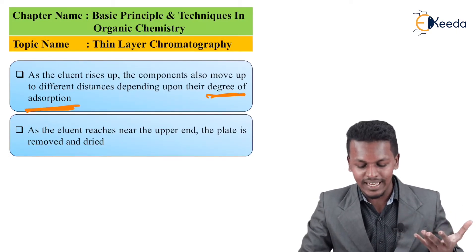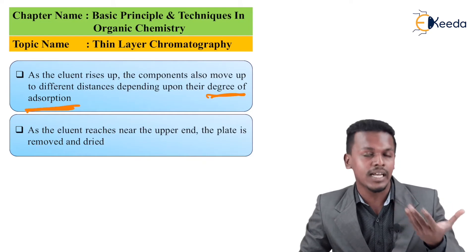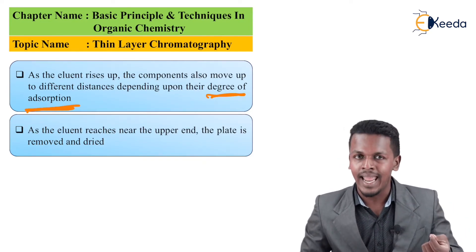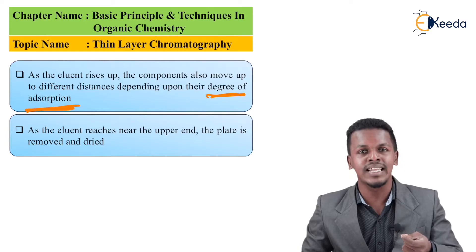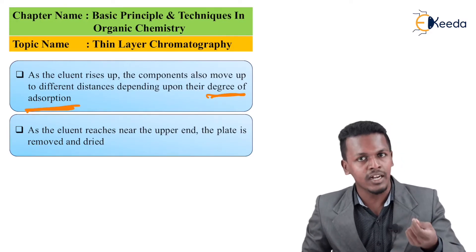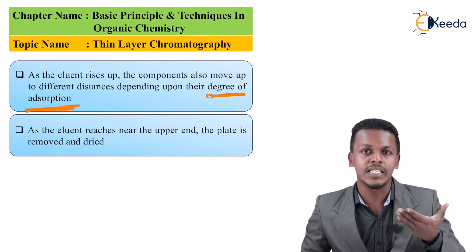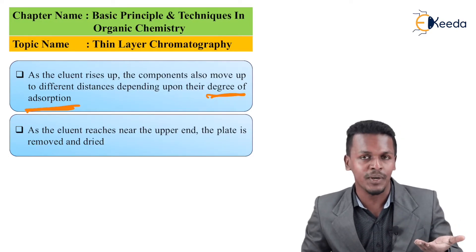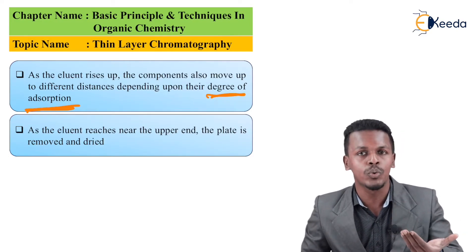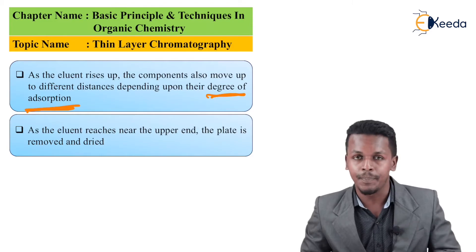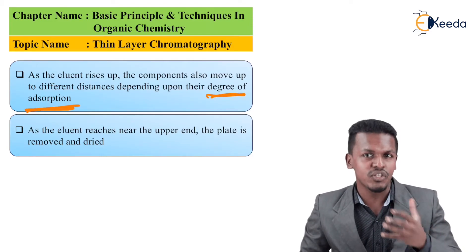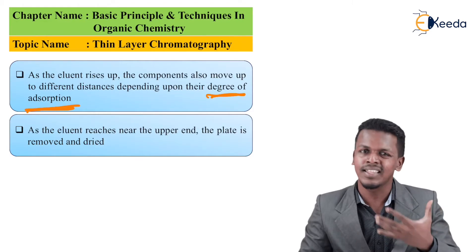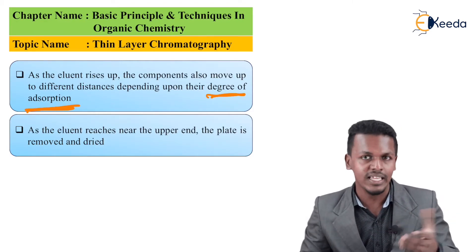As the eluent reaches the upper end, we remove the chromatoplate from the beaker. The chromatoplate is then dried — the solvent is absorbed into the thin layer and must be dried out. The solvent used is a volatile component, so the thin layer chromatoplate can be dried very easily.